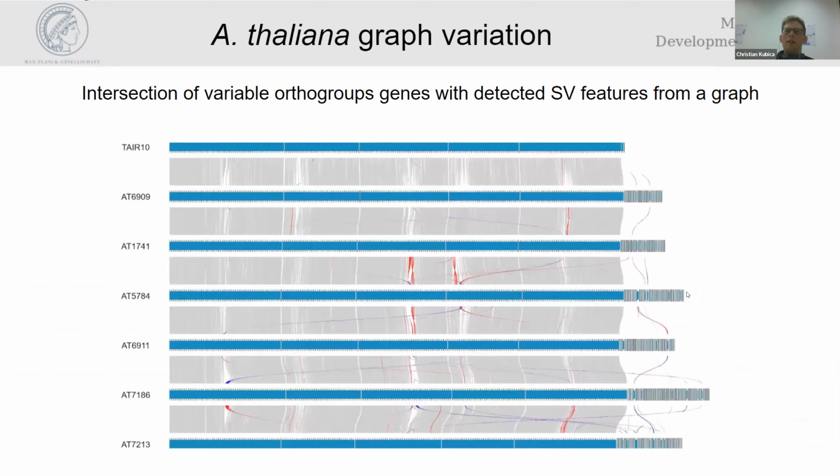And now coming to the end, I want to take you through what we've been doing so far with this tool. In a small example, we are looking at a subset of 6 Arabidopsis genomes now and the reference genome. The second genome here is basically our reassembly of the genotype that has been used for the initial reference genome that is in use today. And then we have 5 additional ones. We produce genome annotations for them. And what we're seeing now here is the genome annotation.